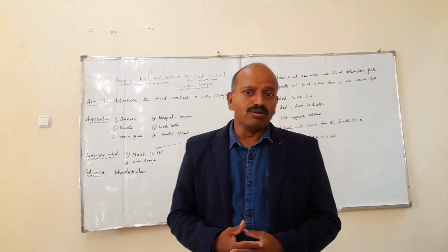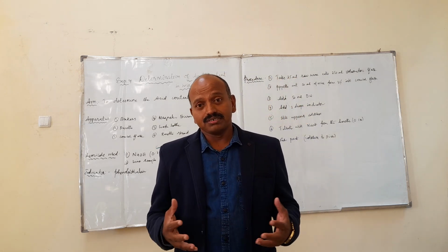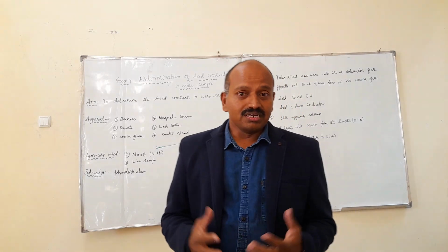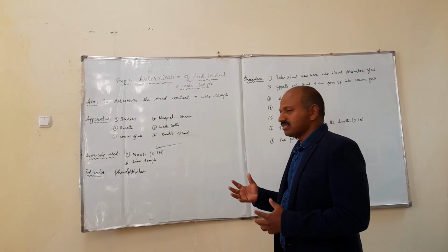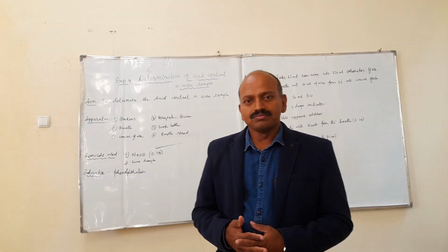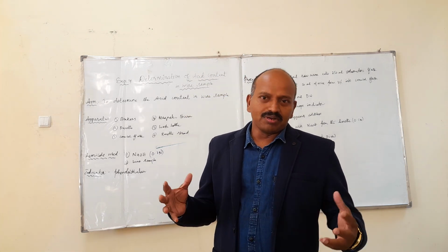And the apparatus used will be the burette, pipette and beakers, and a measuring cylinder can also be used, a magnetic stirrer, etc. All those are the apparatus required. And we can see the chemicals. Here, sodium hydroxide is the chemical mainly used as a base, of 0.1 normal, and the wine sample can also be called a chemical. So these are the chemicals used.